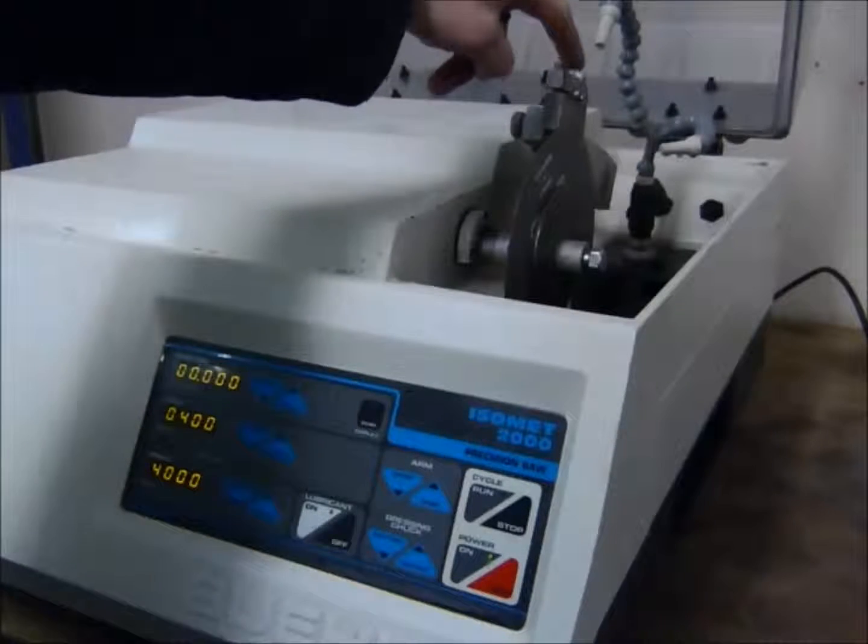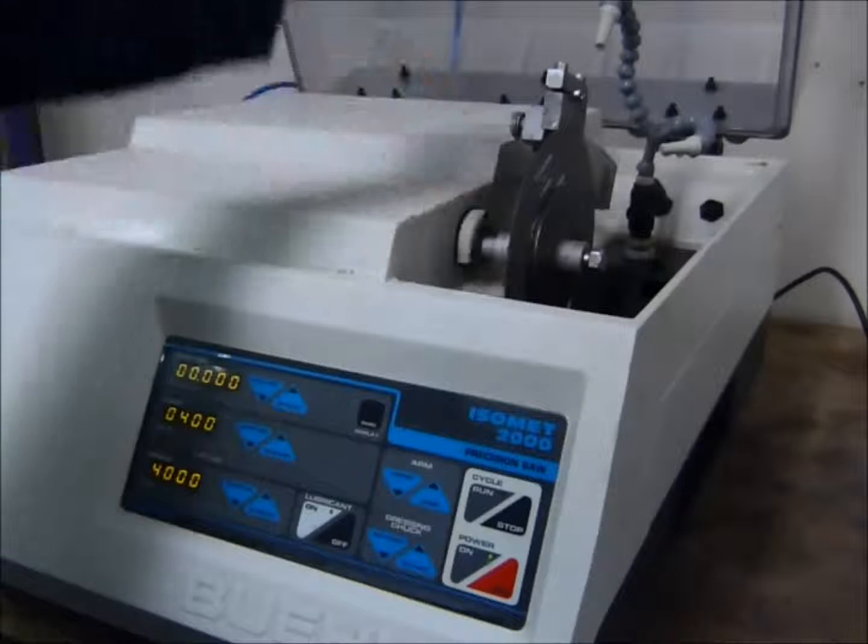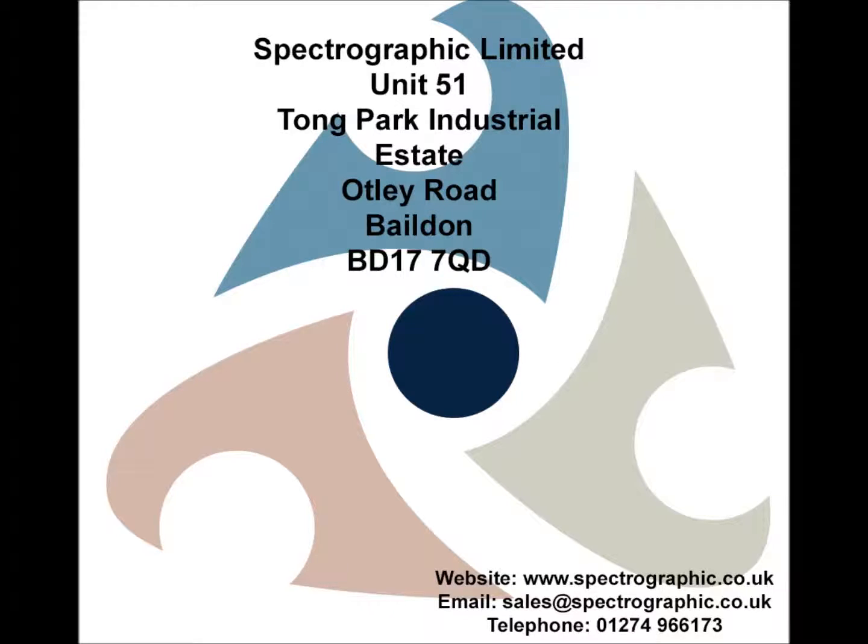As you can see there, it's cut the sample right down and then the arm has raised back up.